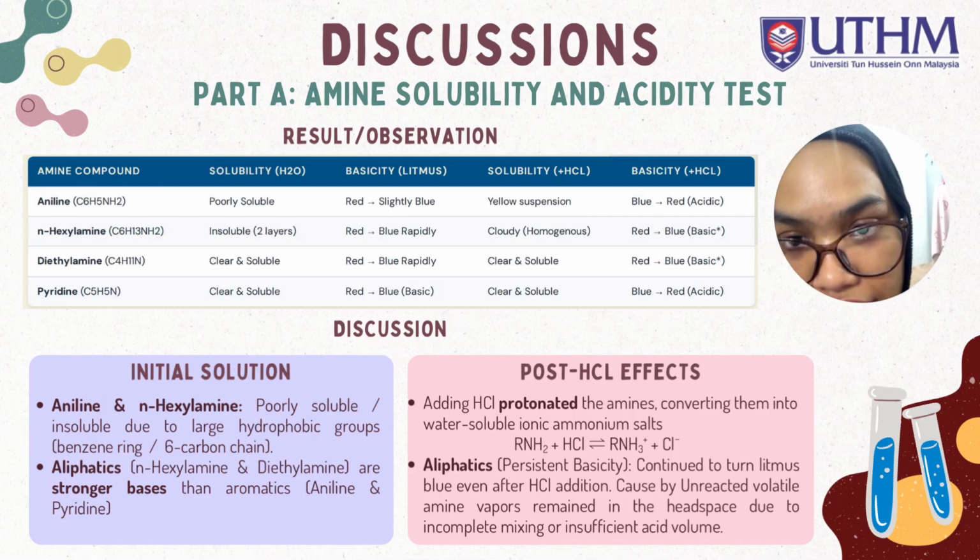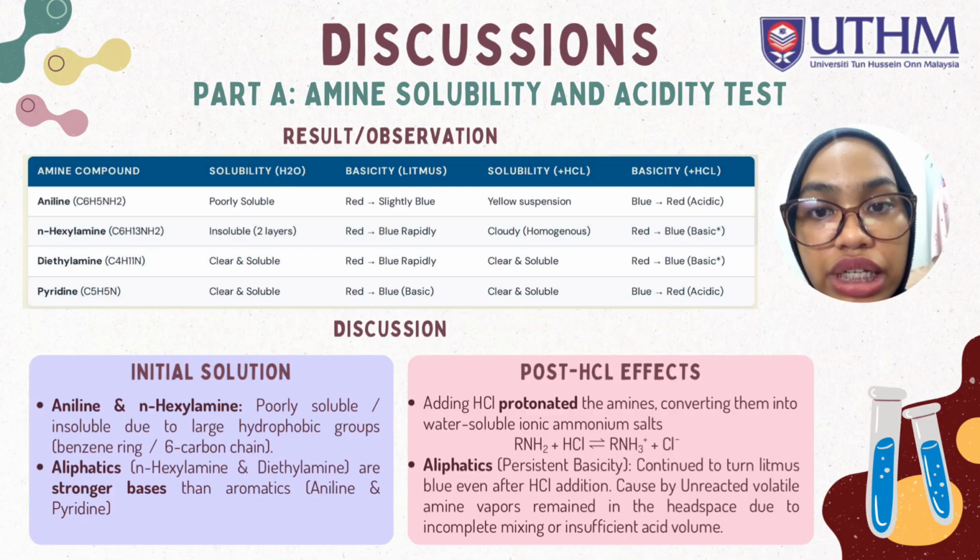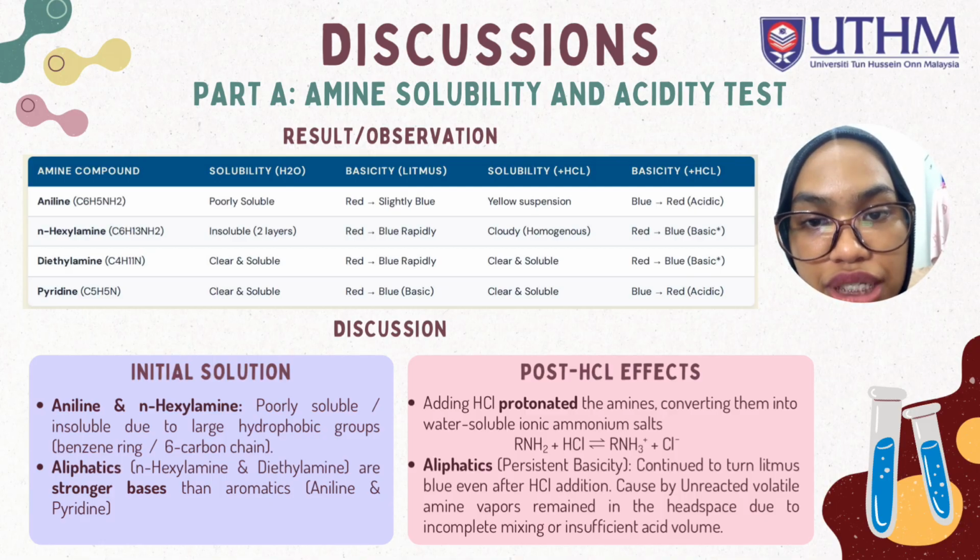For N-hexylamine, insoluble, forms a two-layer. Basicity for H2O is red, turns blue rapidly. Solubility for HCl, cloudy, homogeneous. The basicity is red, turns blue, basic.